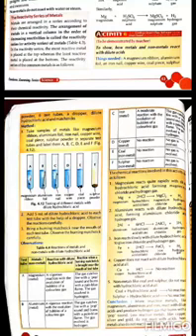Same kind of observations are seen for test tube B, in which aluminium metal is placed. For test tube C, containing iron metal in it, a moderate reaction with evolution of bubbles of a colorless gas is observed.